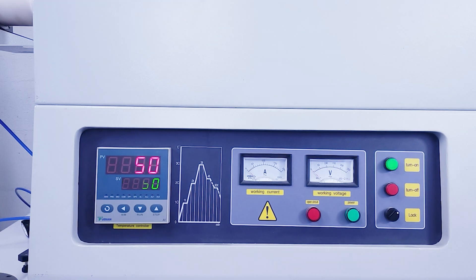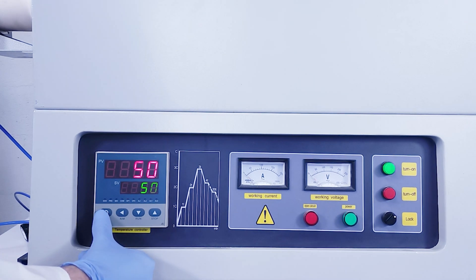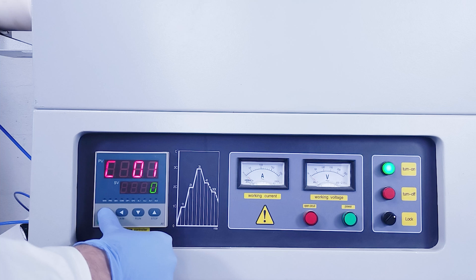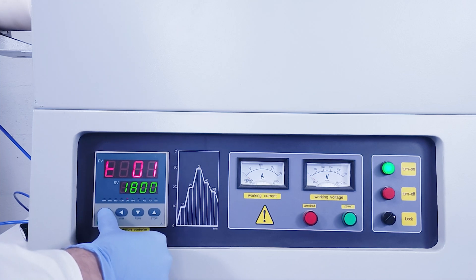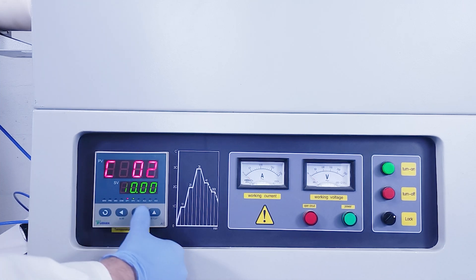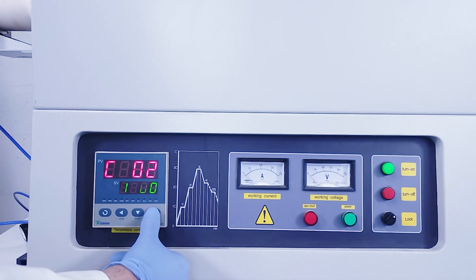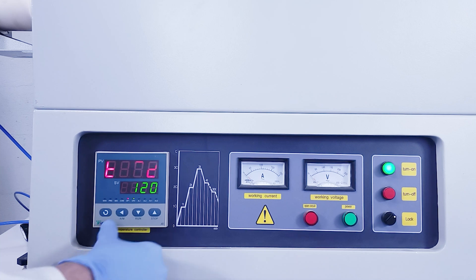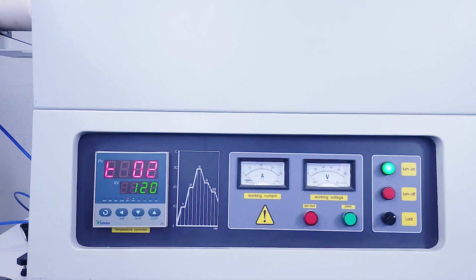Now wait for 'stop' to display on the screen. While programming the cycle, you can't go back to a previous step. In case of an input mistake, just wait until 'stop' is displayed on the screen and then start over.